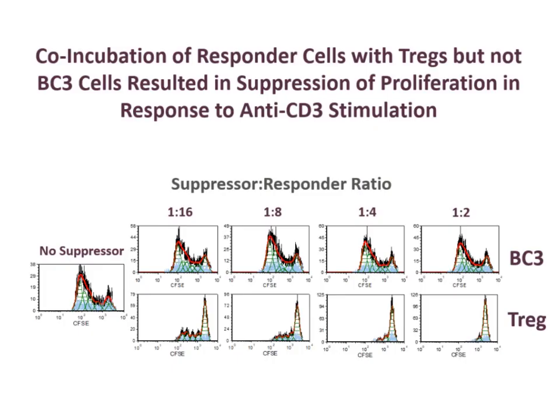We've also used this method to measure T regulatory cells, another one of those protocols that's on our website under the protocols page. When you take T cells and label them and stimulate with anti-CD3, you still have that remaining little peak of the original fluorescent level, but quite a bit of shift.